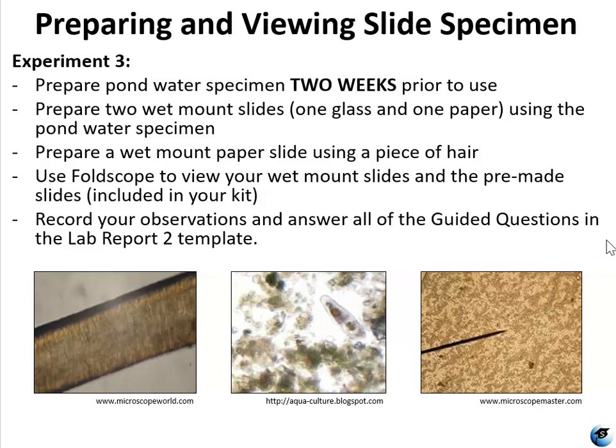You're also going to be using 2 pre-made slides. These are slides that were prepared by me and Dr. Bhattacharya in the lab before you got your kit. You're also going to have a clean glass slide to use for this lab. You're going to be making 2 paper slides.